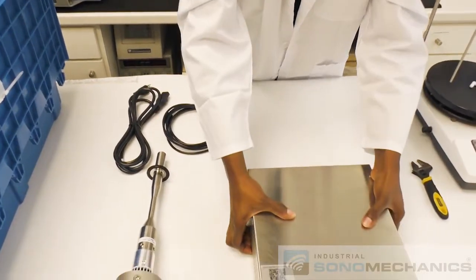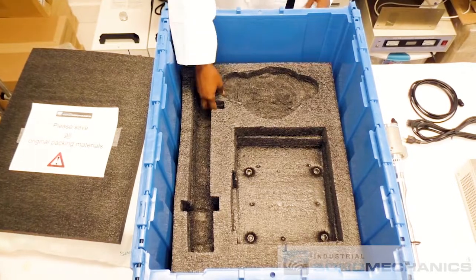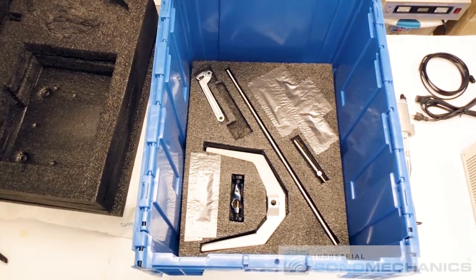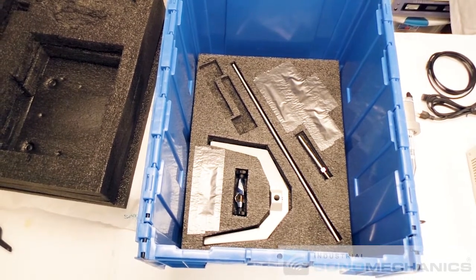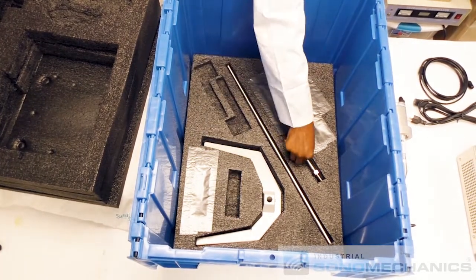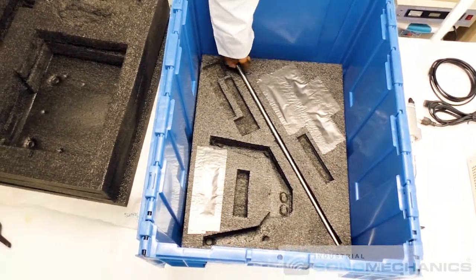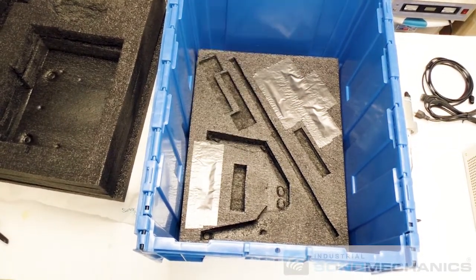Use the QR code on the generator to download the LSP600 processor user manual. Remove the second layer of black foam from the crate and take out the spanner wrenches, clamp holder, transducer support arm, and support stand base and rod. Place them on the workbench and check to make sure there are no remaining items.